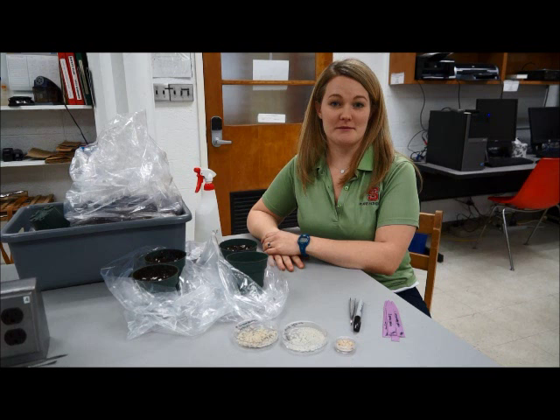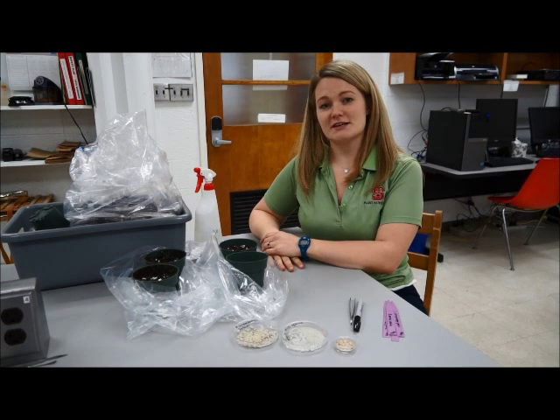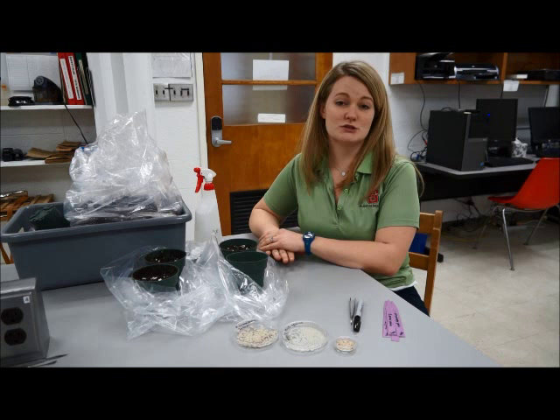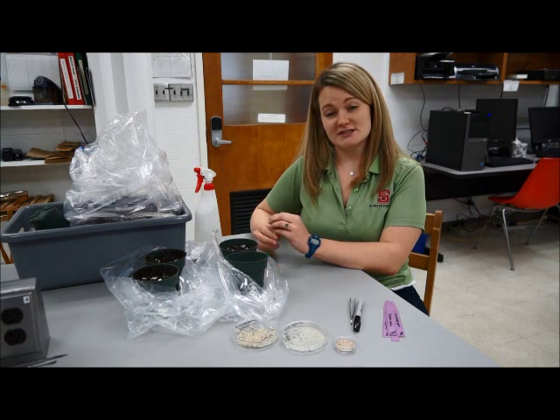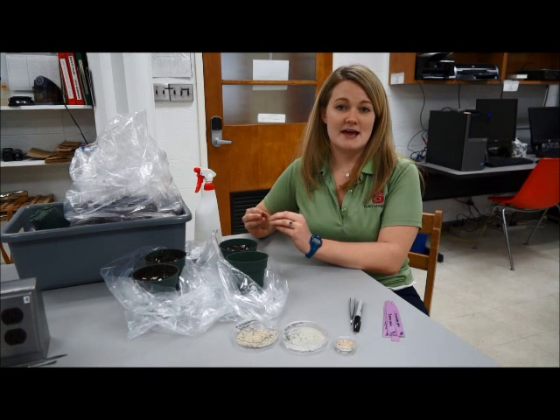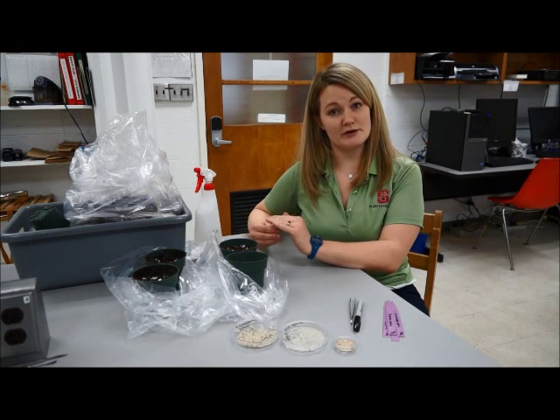Today we're going to talk about Rhizoctonia damping off. We're going to perform a little experiment to demonstrate it. Rhizoctonia damping off is a disease that can happen and be called post-emergence or pre-emergence damping off. With pre-emergence damping off, the seedling will germinate underground, but the Rhizoctonia will come in and kill that seedling before it has a chance to ever break the surface of the soil — and we call that pre-emergence.